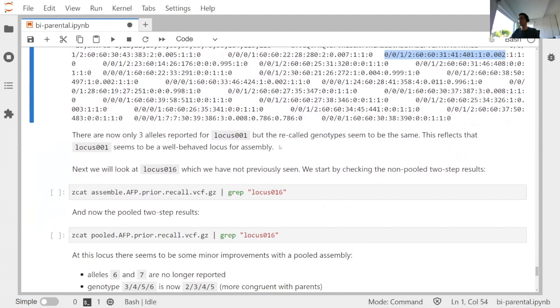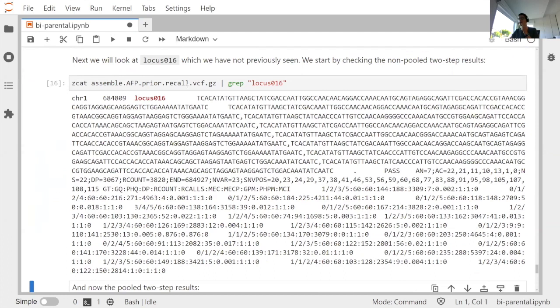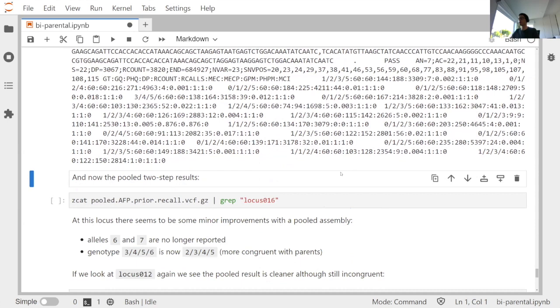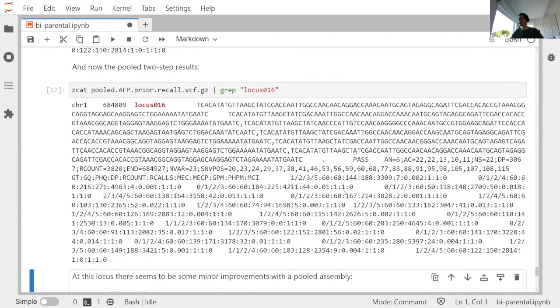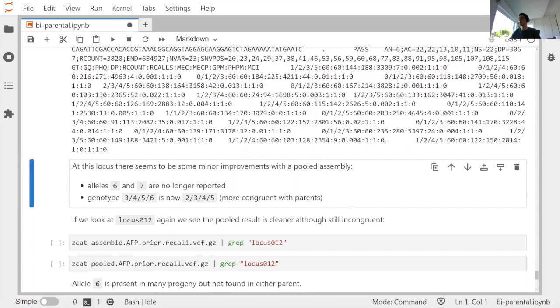Looking at locus 16, which assembled reasonably well initially, some progeny genotype calls contained alleles not present in either parent. Using the pooled two-step approach, we have fewer haplotype calls and allele calls in all progeny now match the parents. A genotype initially called as alleles 3,4,5,6 has now been called as 2,3,4,5 — all alleles found in the parents. It's still not a perfect assembly at this locus, but it has improved using the pooled assembly approach.